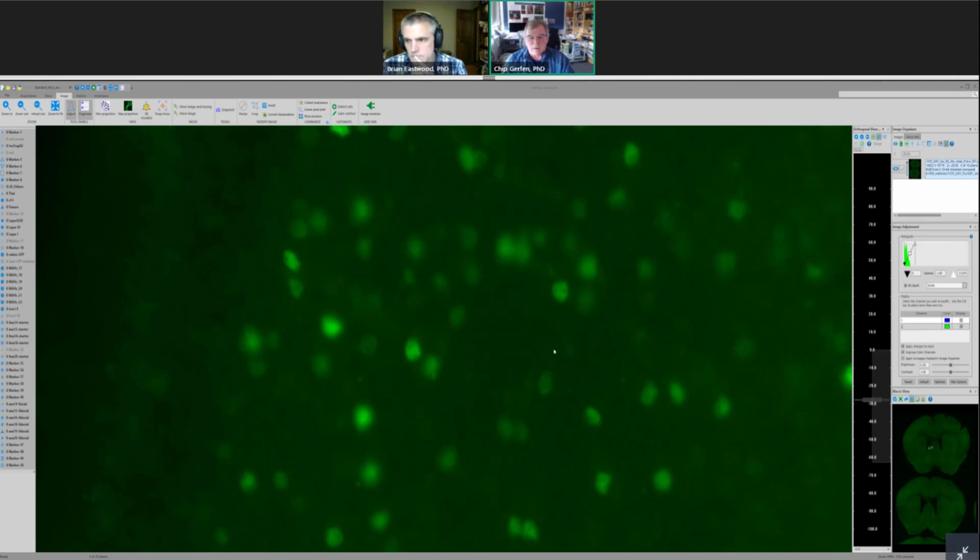Again, it's very important, and this is an example I'm going to use where, similar to what I showed before, as we focus through the different focal planes, you can see the cells come in and out of focus. One of the things with c-fos is that what's labeled primarily is the nucleus of the neuron, so this is more of a circular object. They're smaller also, so getting the right focal plane is important. And so we go through this and say, oh, there's a lot of stuff that's out of focus. But then when we apply the deep focus, they come into focus.